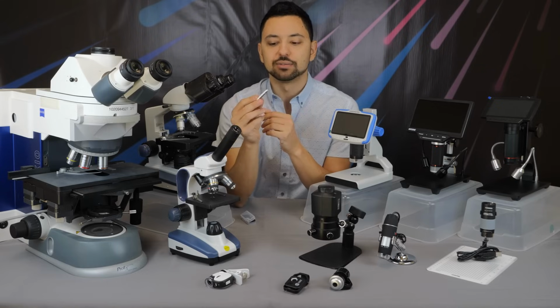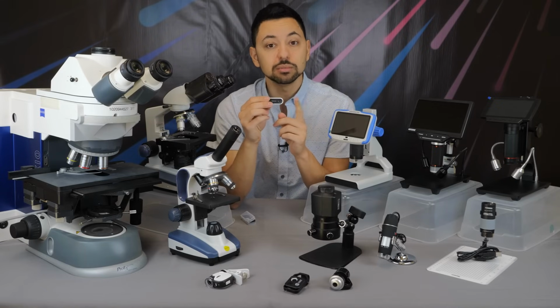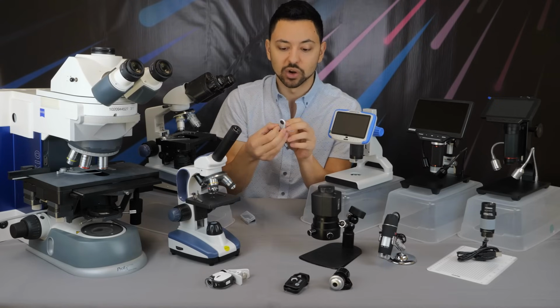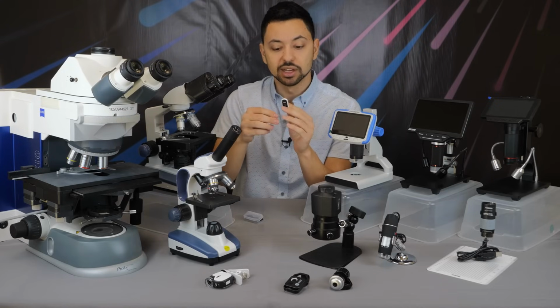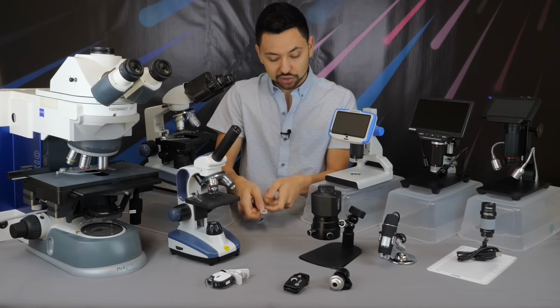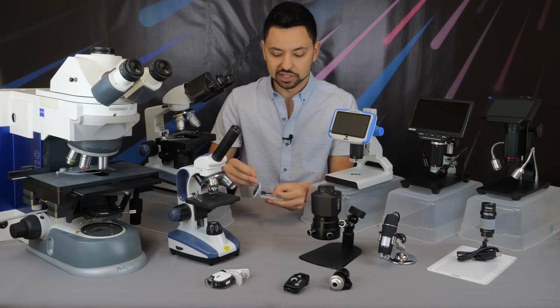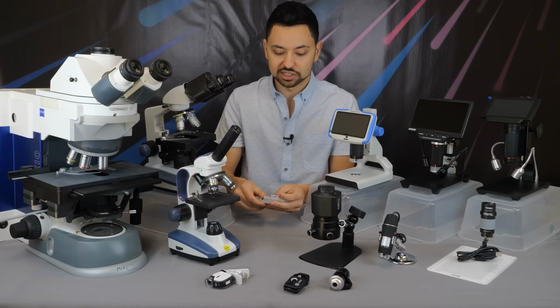The other problem that I have with this Tinyscope is that it requires an extremely close working distance. So whatever you're looking at, it has to be right up against the sample, otherwise it won't work whatsoever. If you're looking at something on a microscope slide with a cover slip, that works perfectly. In fact, they designed it specifically so you could just place it right up against a cover slip. But that really limits what you can actually look at with this microscope because of the high magnification and because the working distance is so short.